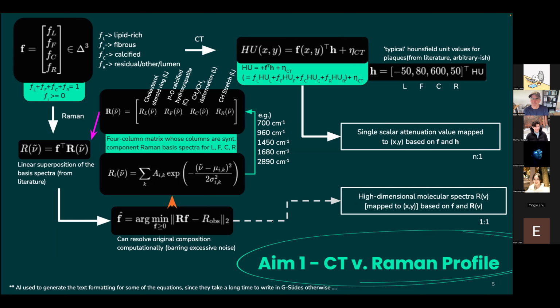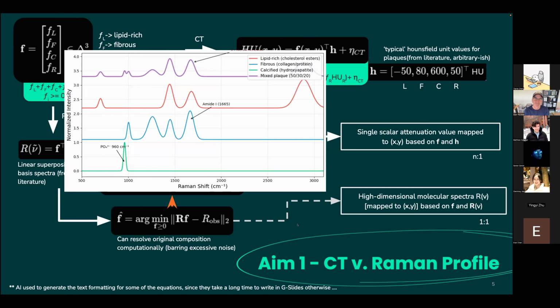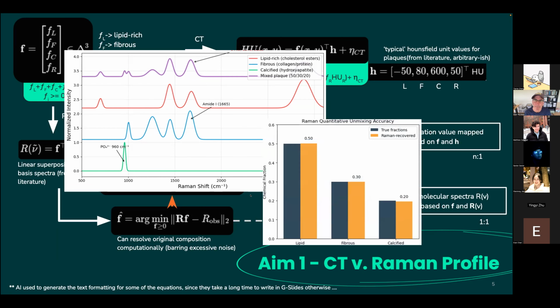So if you hit the next thing, Sardor, okay. There we go. So that's kind of what I meant with adding the Raman shifts together to get a kind of normalized spectra. So that gives a lot more information on what we're doing. So if you move up towards the purple, that's the added together spectra that we're interpreting. Then if you hit it again, this is just a very basic proof that I could do it forwards and backwards, just on some very basic data, but the lack of a noise term makes it a little bit benign. So continue forward.